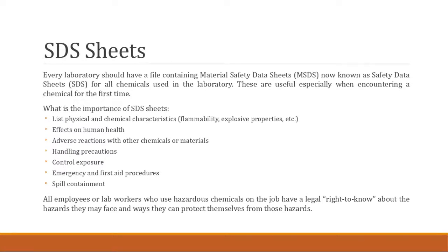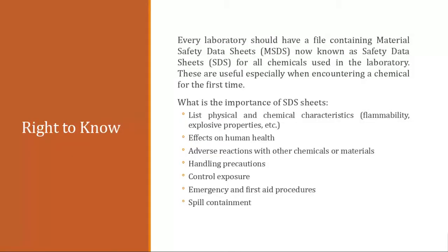The thing about it is anybody working in the lab has a legal right to know about the hazards they face and ways that you can protect yourselves from those hazards. So having these safety data sheets listing all of that will provide you that right to know.